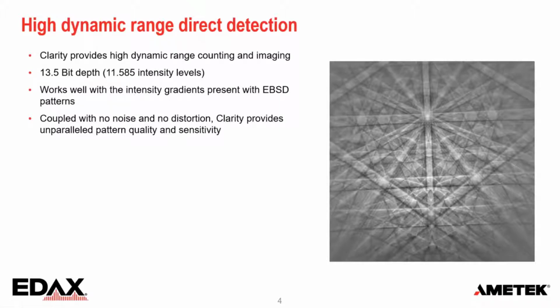So expressed in bits, it's about 13.5 bit depth, and that allows you to get a very wide range of intensity variations in your pattern. So you can go very dark, very bright, and all the details in between. That will really give you fantastic EBSD patterns that you can use, for example, for dynamic simulations or crystallographic analysis.